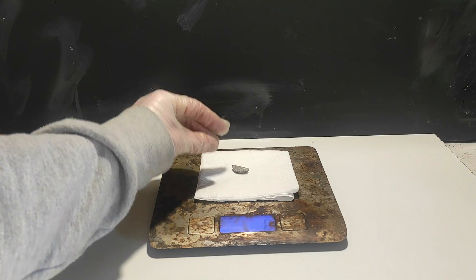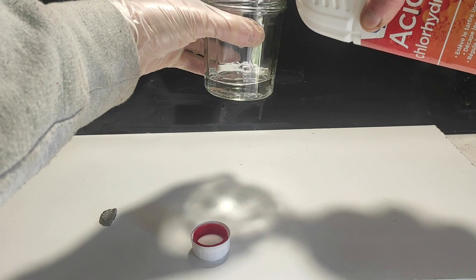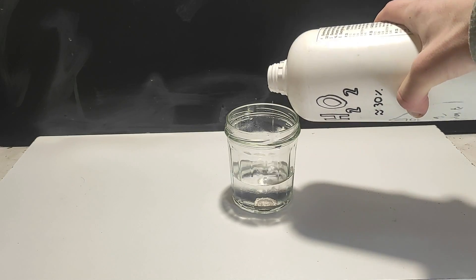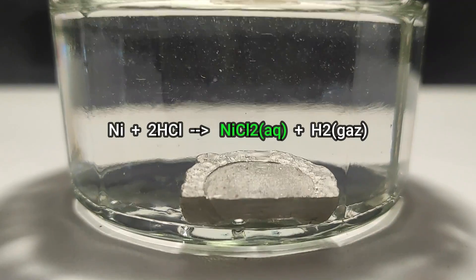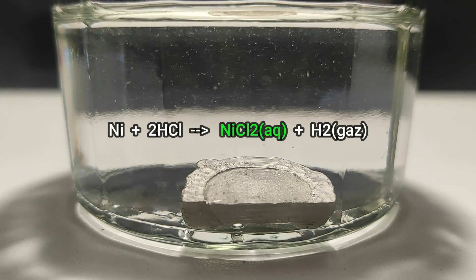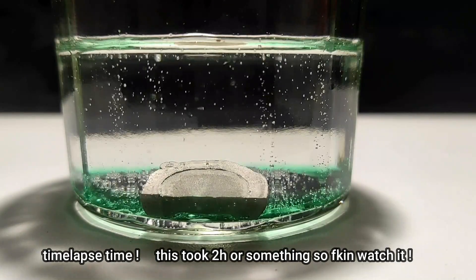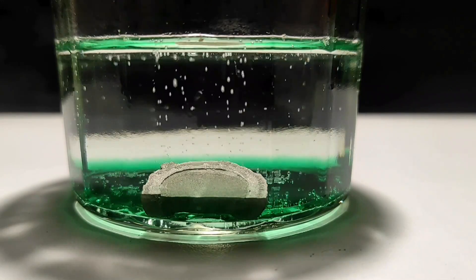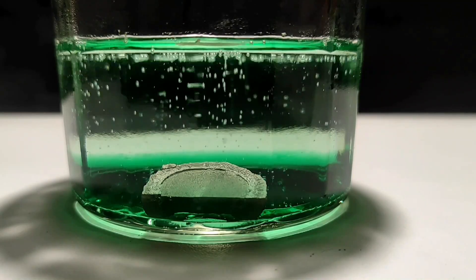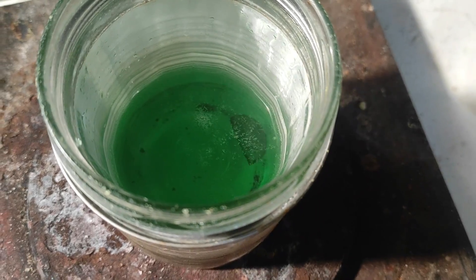I weighed a half coin on my trusty scale and it turned out to be 11g, which feels like a good amount. Then I used a random amount of hydrochloric acid and some hydrogen peroxide to dissolve the metal. As you can see from the equation, this reaction produces some hydrogen gas which leaves as small bubbles. This should form some beautiful nickel chloride, which is emerald green. Now I'm going to remove the metal — at room temperature it was too slow so I heated up the solution to make it react faster.